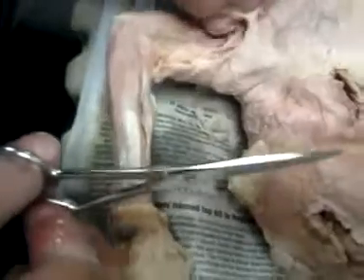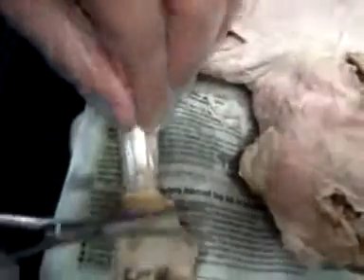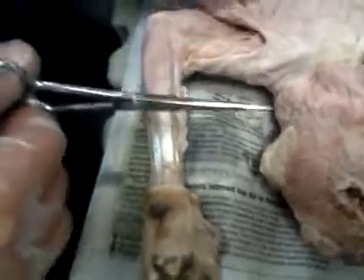Yeah. Damn, look at this hammy right here. Big ass ham. No wonder they can jump so far. I know, dude, look at this hammy. Is it, no, this is a calf, right? Yeah, it's a calf. It could be a hammy. Well, half of a hammy comes on. Oh, yeah. It's cut off! That's your adductor muscle. Wait, did you take off the connective tissue down here?